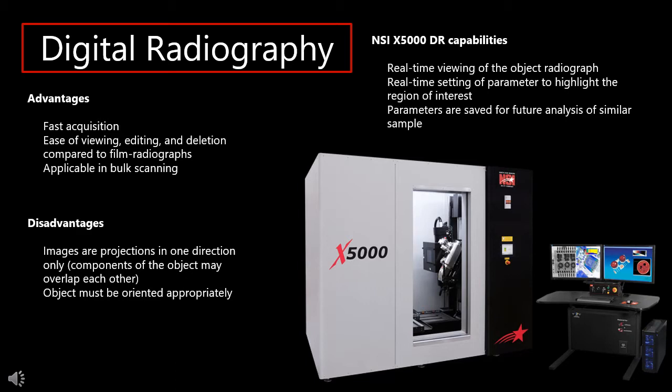In ADMATEL, we use a North Star Imaging X5000 X-ray machine, and it has the capability to view the radiograph in real time. So it means that in real time, we can also set the parameters of this X-ray so that we can highlight the region of interest. These parameters can also be saved so that we can use them for future analysis of similar samples. And that would be it for our short discussion on digital radiography.